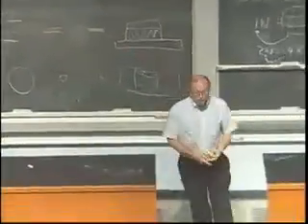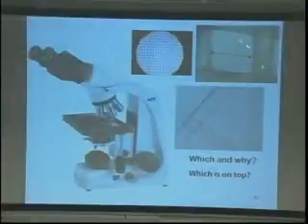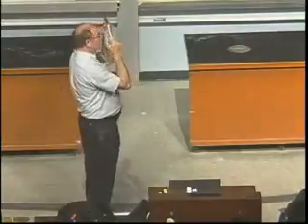So anyway, what we're going to do to measure or calibrate that measuring device, the ruler, is that image, since it's in here, will be superimposed upon whatever we see. Now, I wear glasses. My glasses are expensive because I have horrible vision, but if I was wealthy enough, I'd make 100 edges on my glasses. And then when I look at a piece of paper that's very close, I'd see those 100 edges superimposed upon the paper, right? If I hold it further away, are those distances they represent getting bigger or smaller? Larger. If I grab binoculars and look at the mountains, it'd be even larger yet, right?